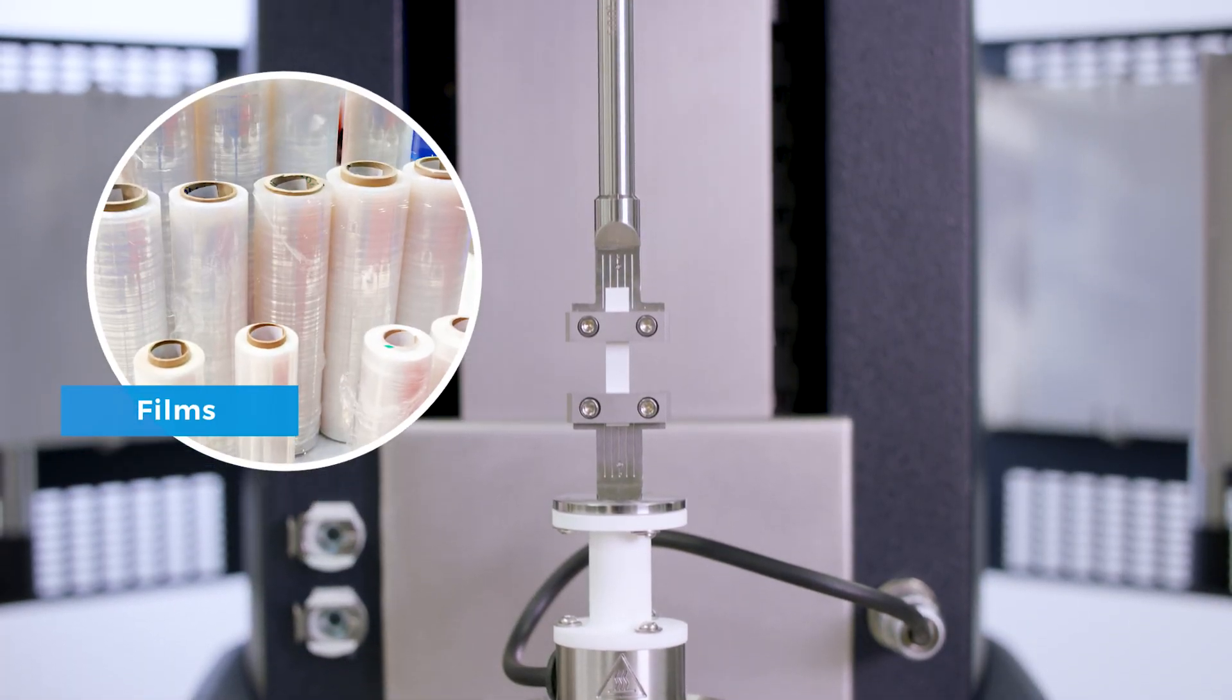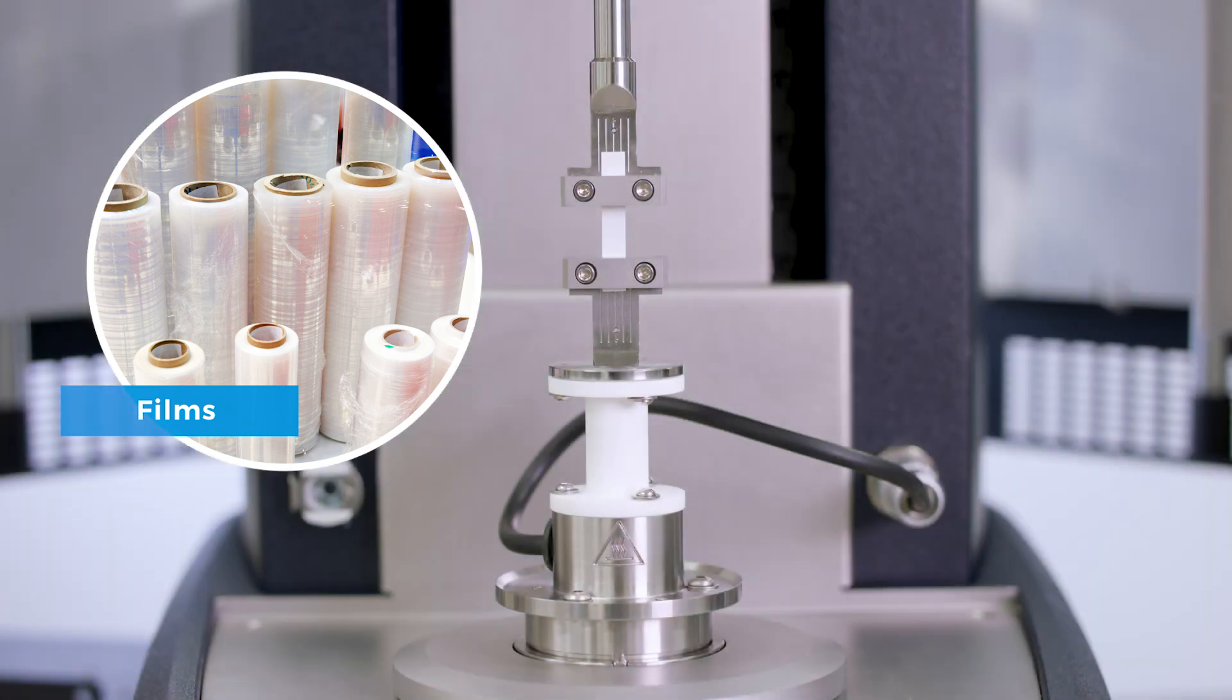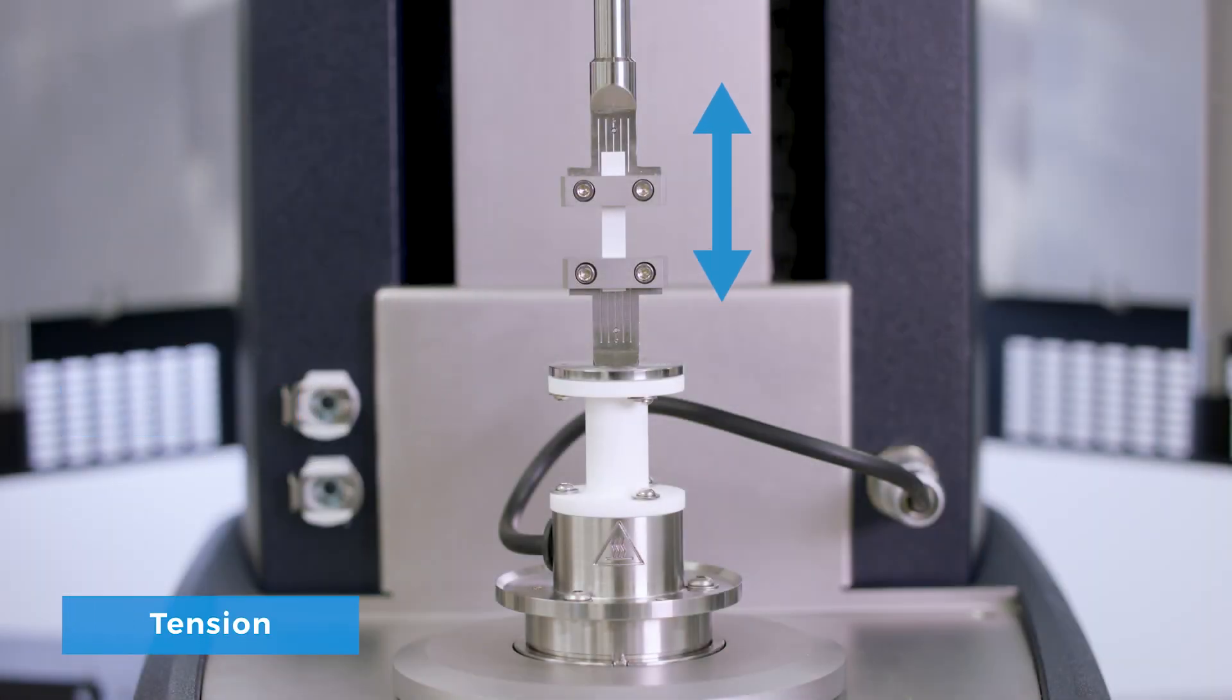For samples that are thin films or sheets less than half a millimeter in thickness, the film tension geometry can be used to perform the measurement in the tension mode.